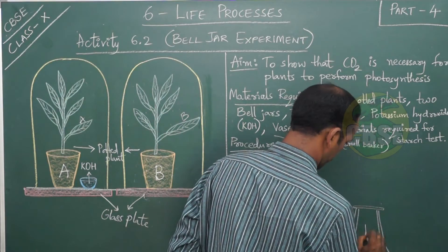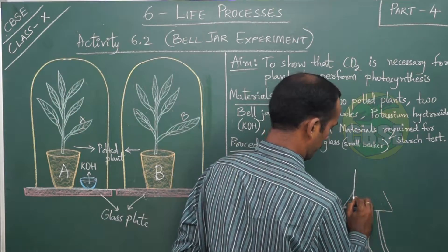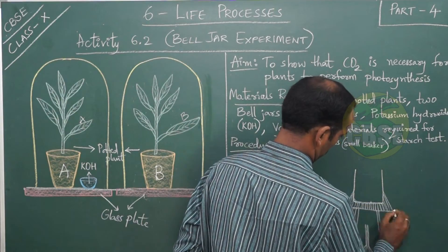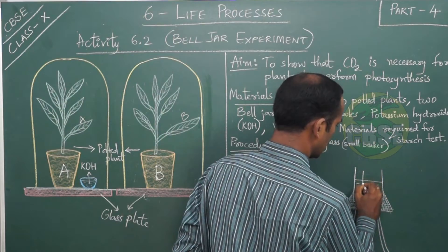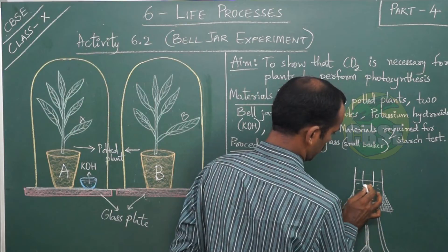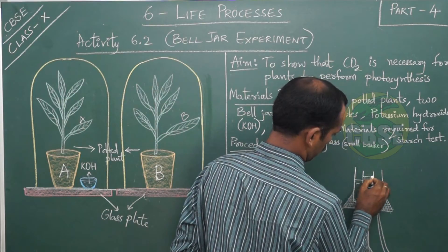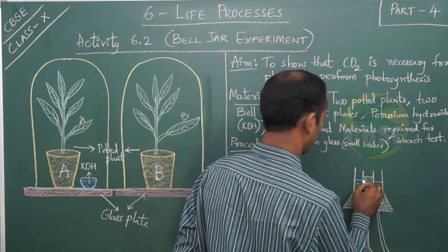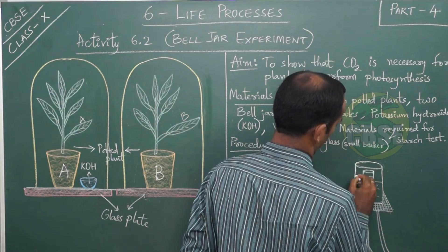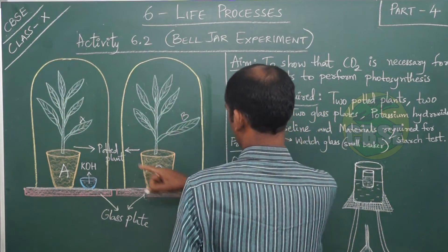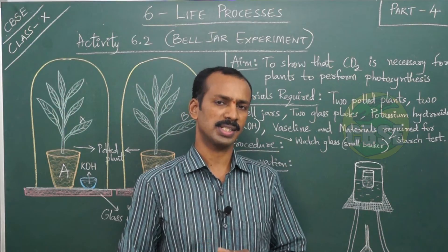You know the procedure for starch test from the previous video. The same procedure applies here: tripod stand, Bunsen burner, wire gauge, water bath with water in it, then placing a beaker which consists of alcohol. We are going to test leaf A first, in the same manner as in the previous activity.